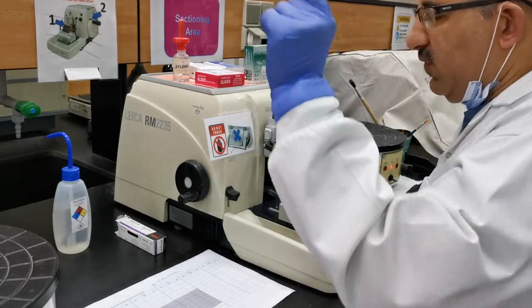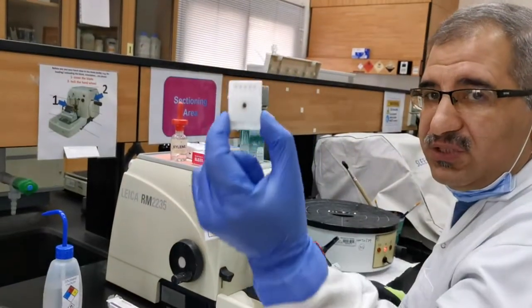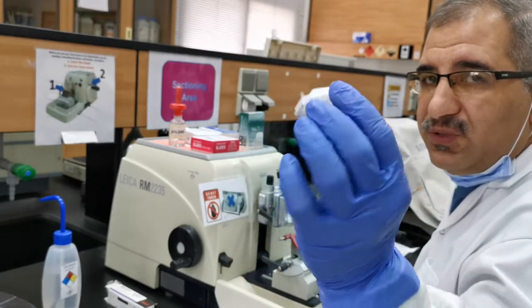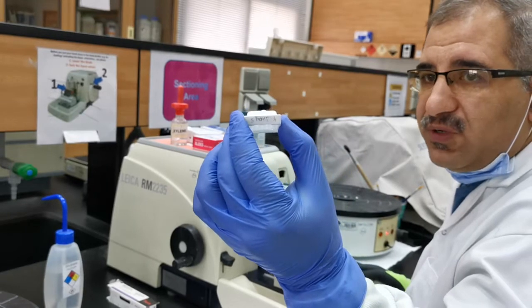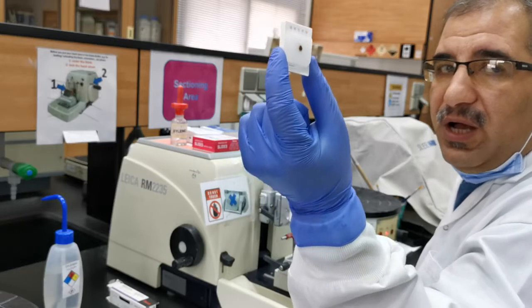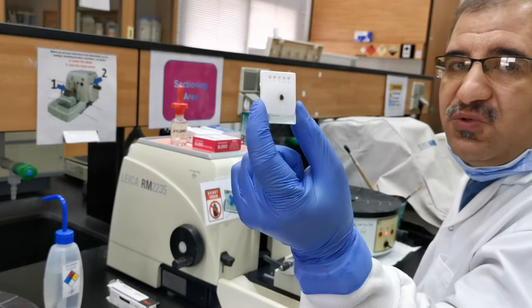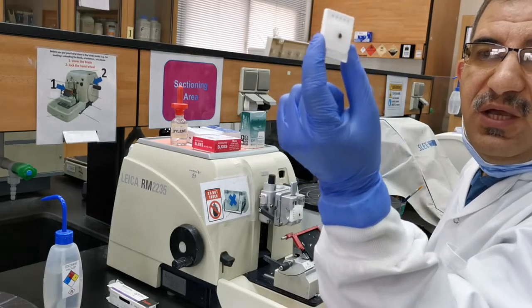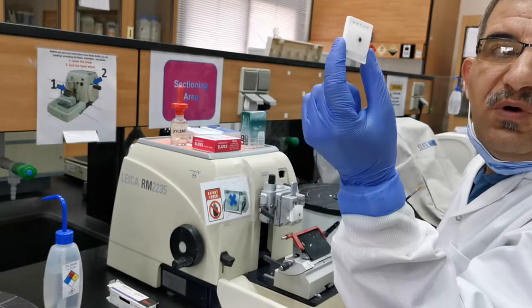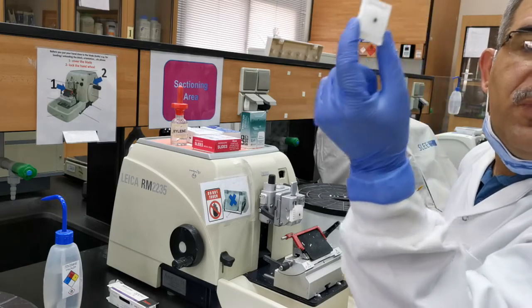First of all, you have your paraffin block containing your tissue, labeled very well with your name and tissue type, depending on the setup you are working in. Before that, you need to put your paraffin block on an ice plate for maybe one to two minutes to solidify it. This will make your cutting much better and easier. Remember, it might be a little bit warm in the room, so working with warm paraffin won't be a good experience for your block, for you, or for your tissues.